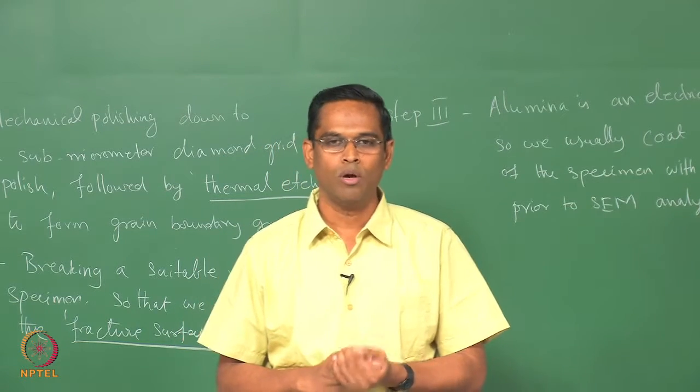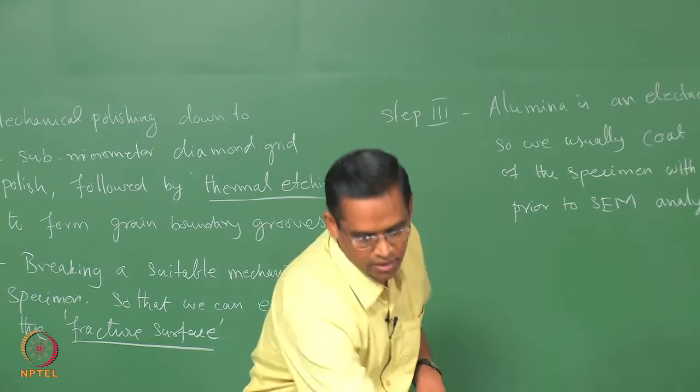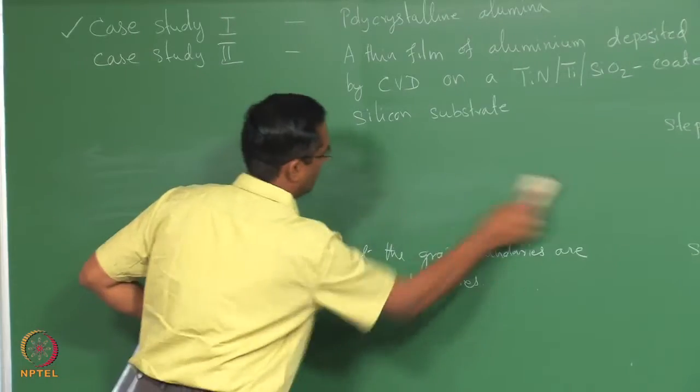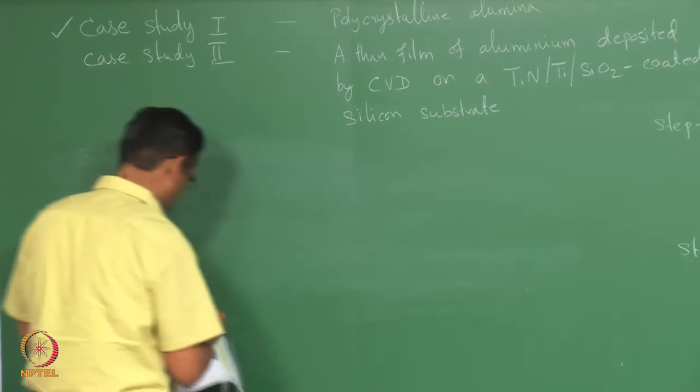So, the lower kV is the better way of using this. So, we will write down some of these observations so that you will not forget these things.